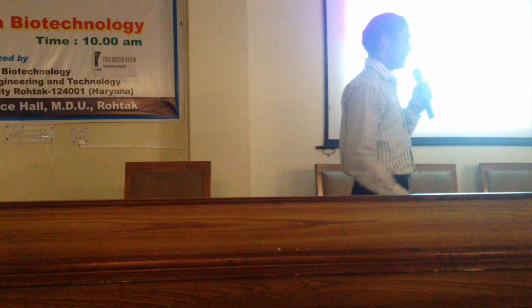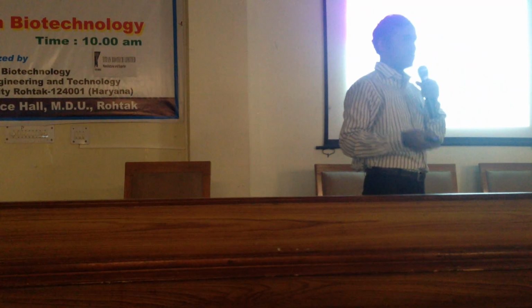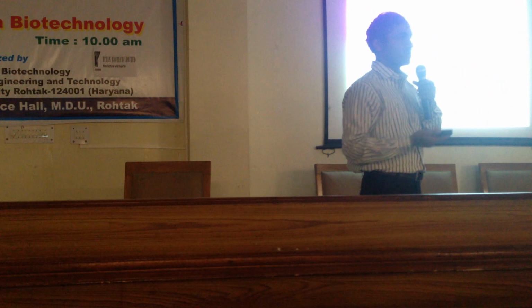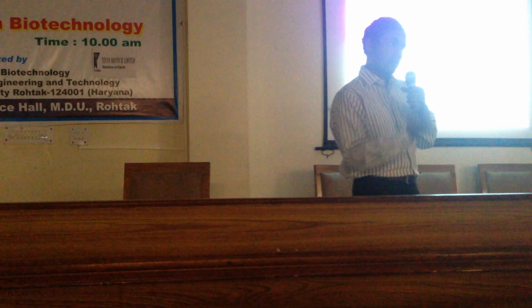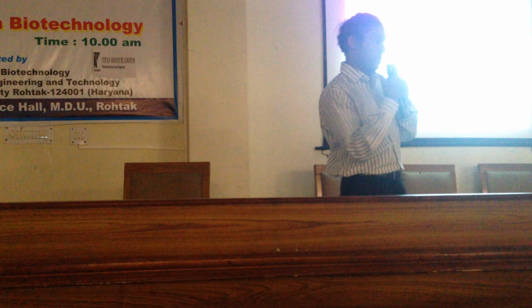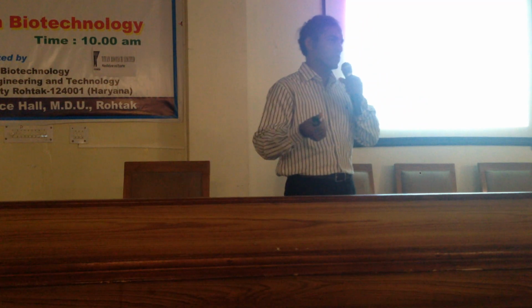Now my presentation plan, although I added one more point in the last moments, which I'll share with you. I'll be discussing the classical methods, that is Maxam-Gilbert and Sanger's method. Then, before actually discussing the technologies, I'll tell you about the potential applications of these technologies, so that you can appreciate the technology.